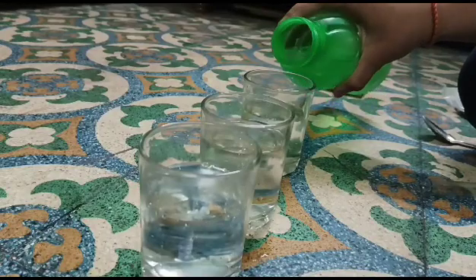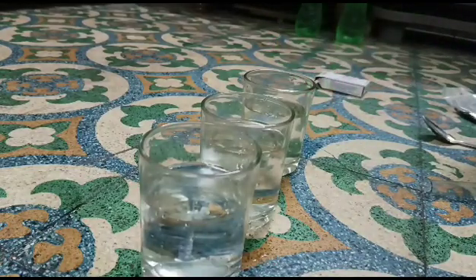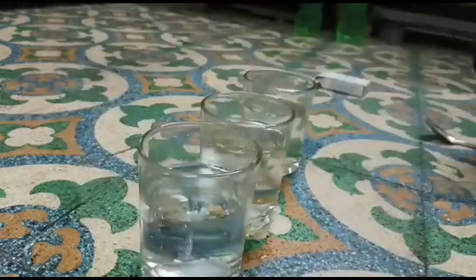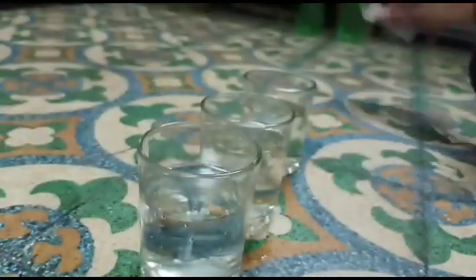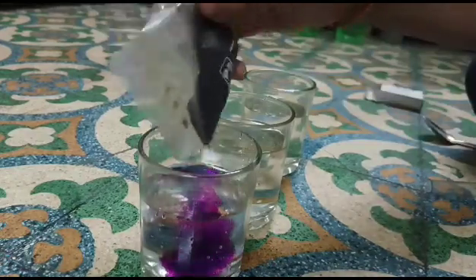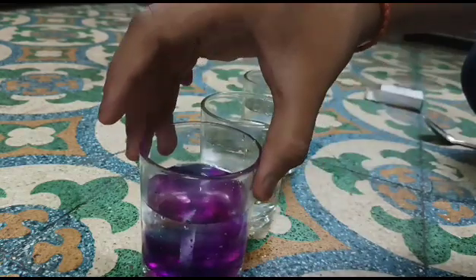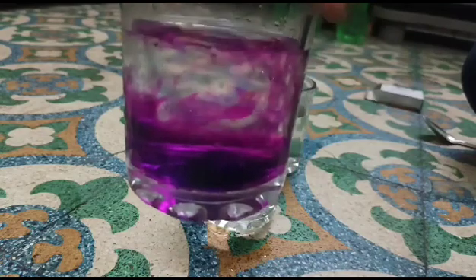Now take potassium permanganate, that is KMnO4, and it will be easily available in any medical shop. You can buy it. It is a purple powder in form. Now I have taken around 6 grams of potassium permanganate, 6 grams, not more than that.